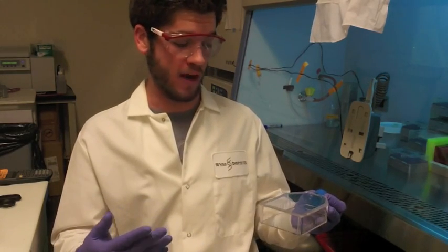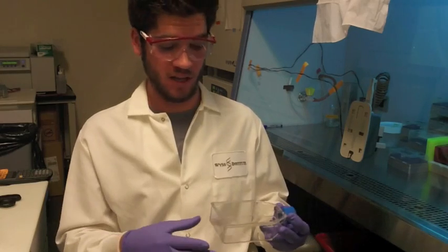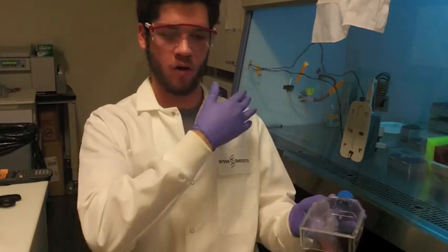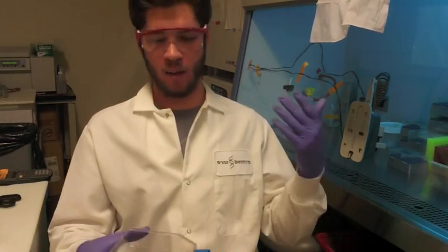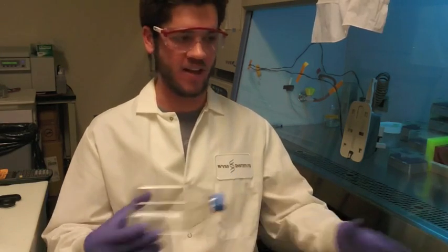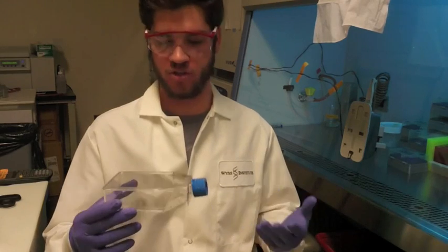So what is done currently is every 3 to 4 days, the researcher will have to come back and remove all the old media, remove the cells, put the cells into new media, and put those into a new flask. This is a process that can take an hour to 2 hours, and it has to be done like clockwork every 3 or 4 days, or your cells will die. So it's an enormous sink on time, given that the vast majority of laboratory biologists do this or some variation on this process. So it's a very common problem.